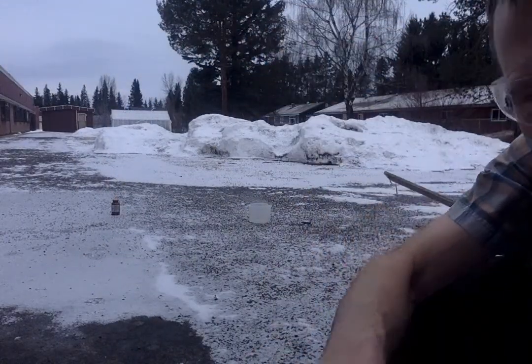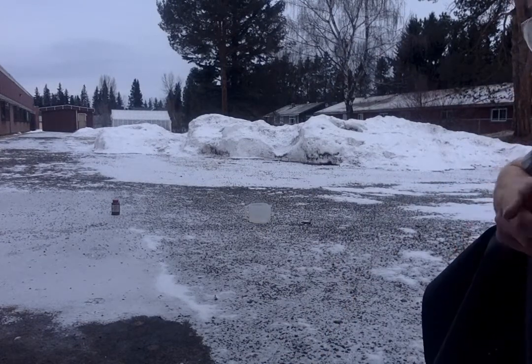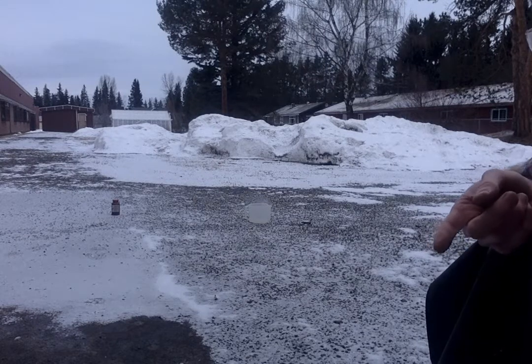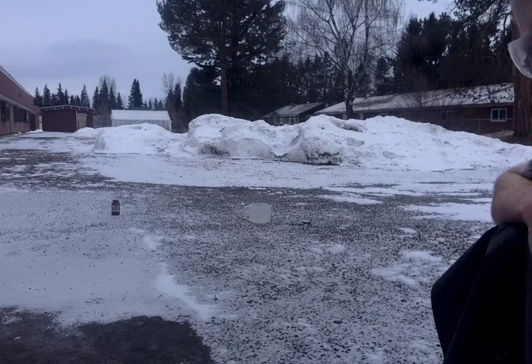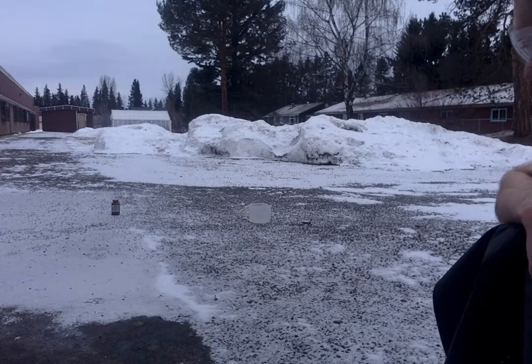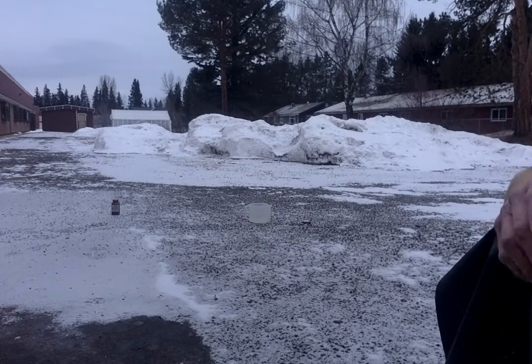You can't see it, but what's happening here is the sodium is floating on the water. It's floating on the water because it instantly reacts with water and produces hydrogen gas. The hydrogen gas acts like a little flotation device around the piece of sodium. When this gets more intense, which it sometimes will and sometimes won't, the hydrogen gas will become ignited, and there is an explosion. Sometimes it happens, sometimes it doesn't.